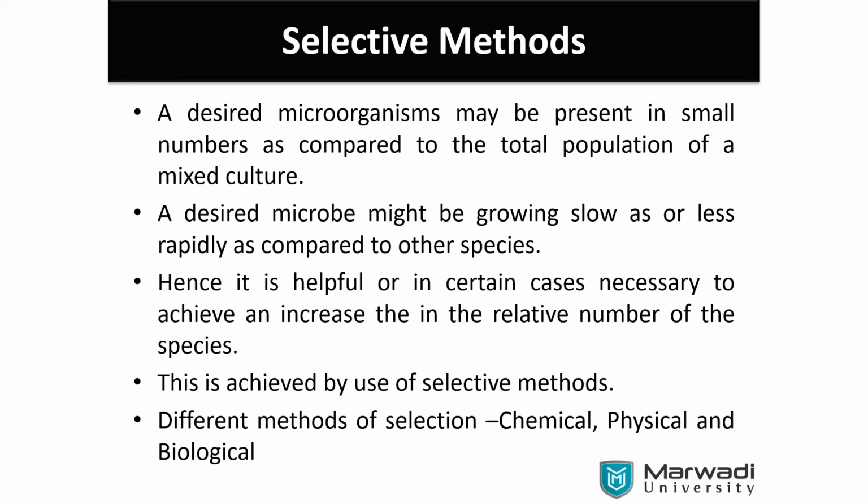No, it's also not E. coli. Not E. coli. Just the contaminations. Both are different contaminations. That is why I told that we may go for doing the experimentation again. It is required to. That is the 4 quarters. Streaking will be done. Then after that the spread and everything.